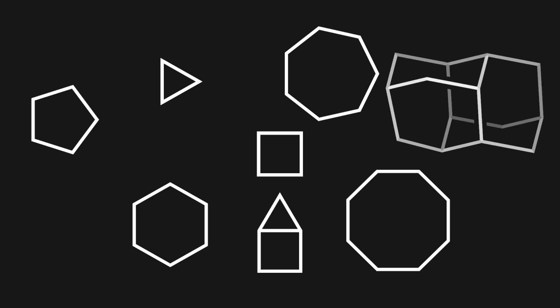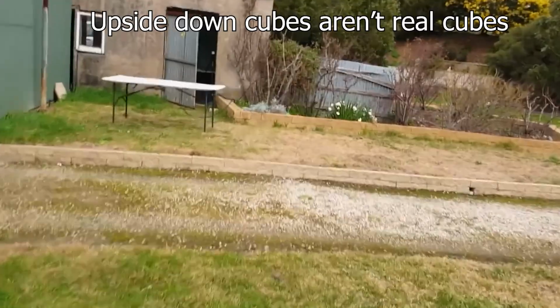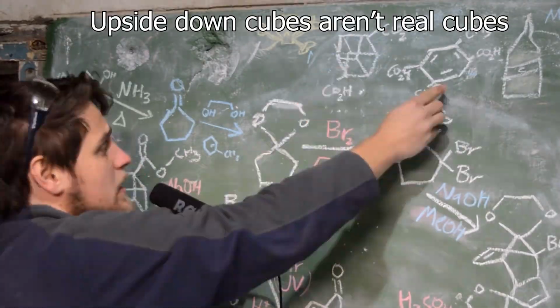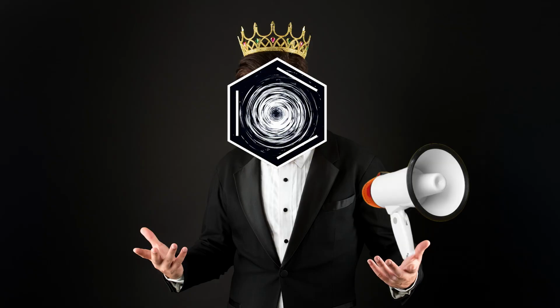Geometry? Hell yeah. Chemistry? Hell yeah. Chemical geometry? Hell yeah. Chemistry has a lot of weird shapes. Like, some guy in Australia is trying to make a cube in his crack shed. Yeah, right. Anyhow, I found a shape that deserves all the attention.